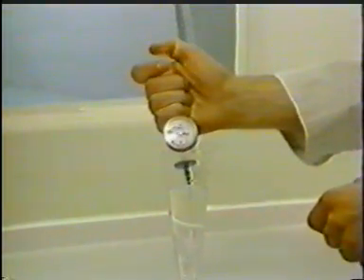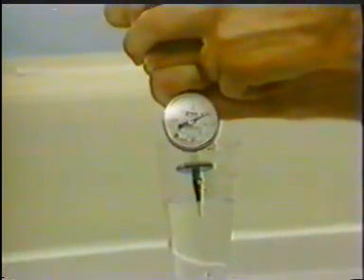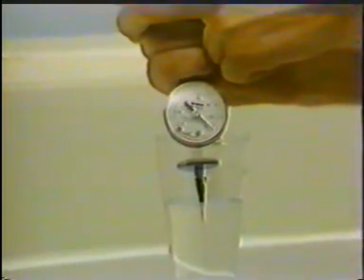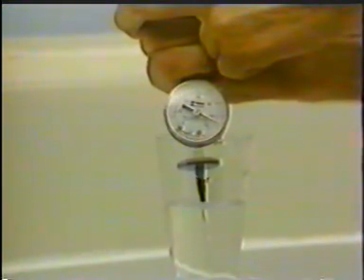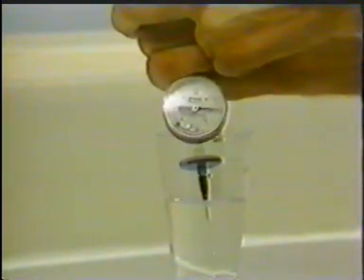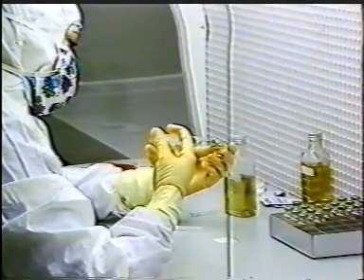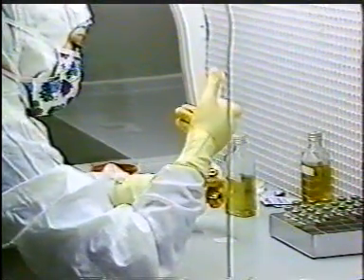With aseptically prepared batches, the assurance given by a temperature record chart is lacking. Bubble point testing is carried out at the end of the process to check the integrity of the sterilizing filter used. But the whole process is much more dependent on operator technique. The chance of an odd container being contaminated is much higher than with heat sterilized products. Consequently, it is necessary to monitor operator technique using broth transfer trials to give an additional degree of assurance.